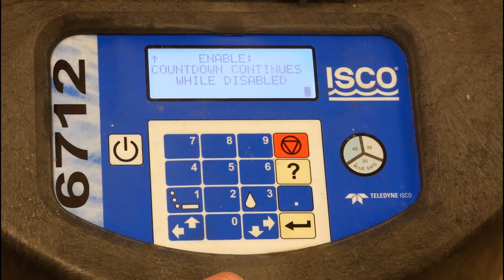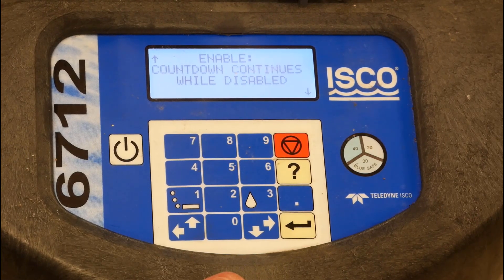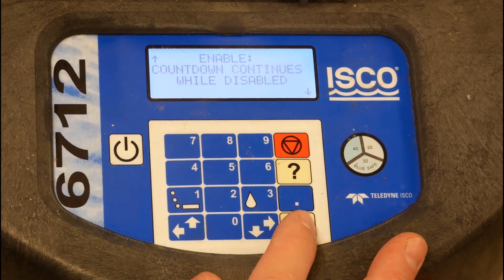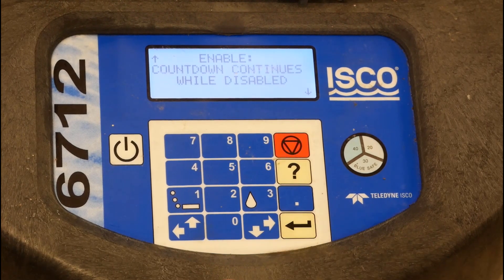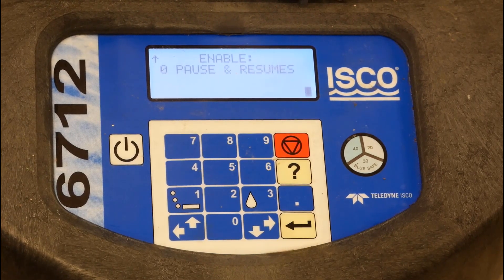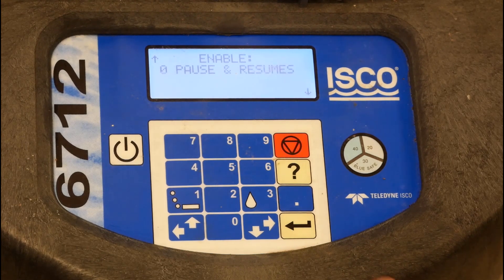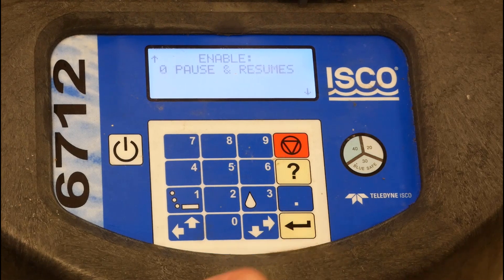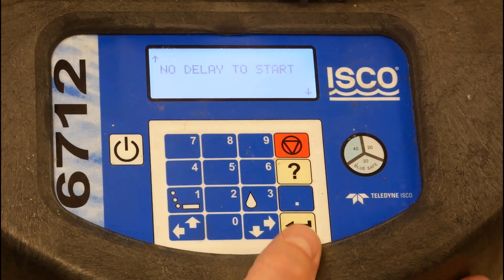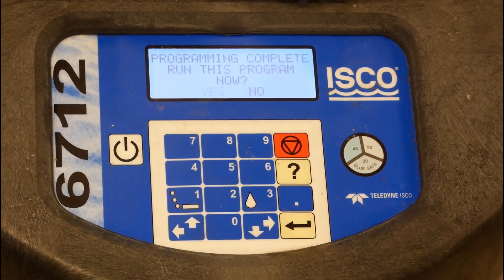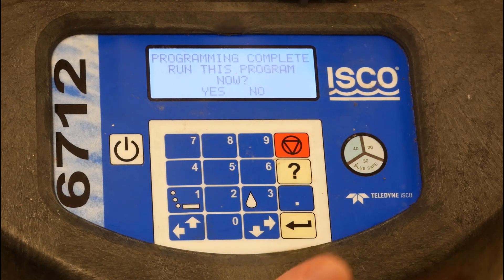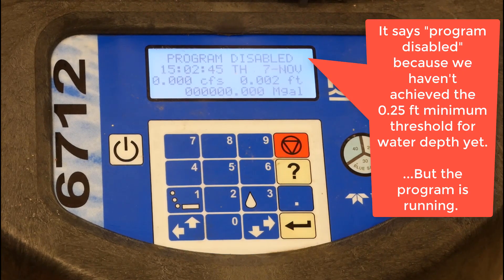We're going to continually count down, so if we were doing a time phase, this would continually count even if the conditions weren't met. We're not going to pause or resume the program — it's just going to run continuously in perpetuity. We're not going to delay the start; we're going to start this program right now. And now it's running.